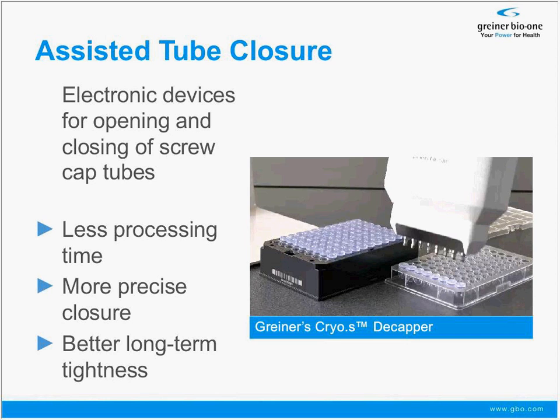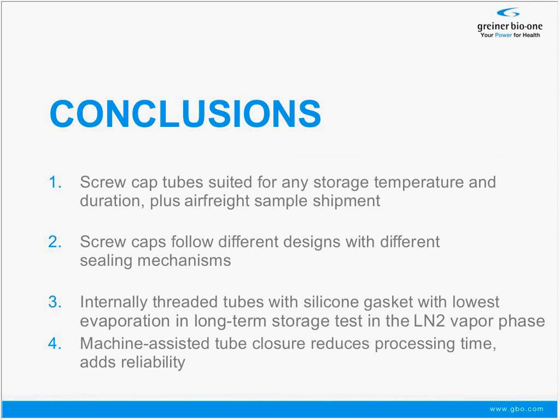These data are not shown here, the long-term tightness, but I will later on refer to a piece of literature which Greiner Bio-One has recently launched and published, and there you can get more insight and even find these data. The conclusion in total is that screw cap tubes are suited for any temperature of storage and also for any duration of storage, plus they can be used for freight sample shipment.